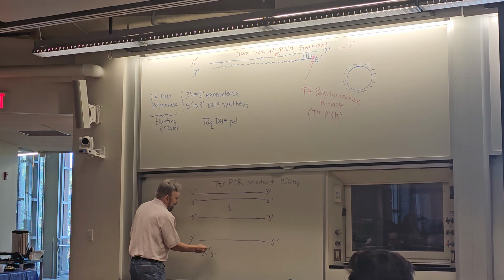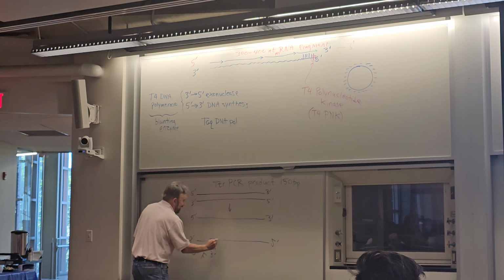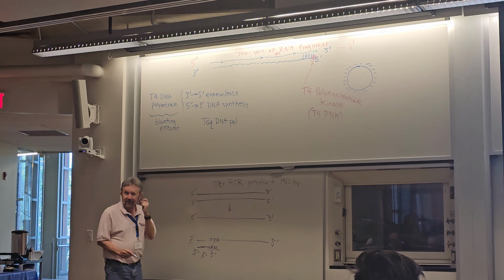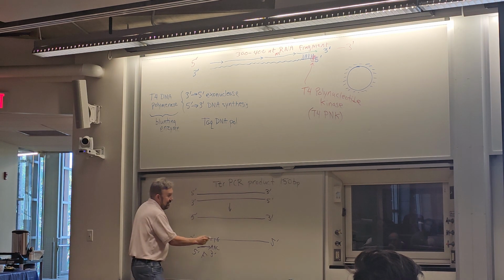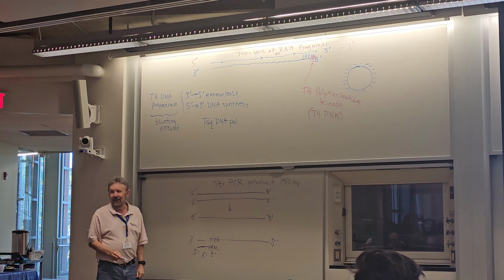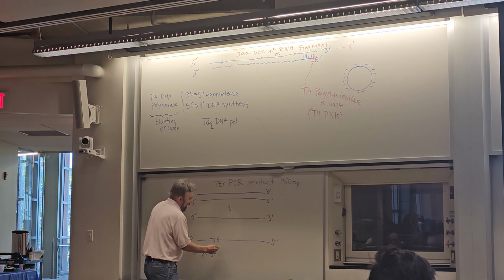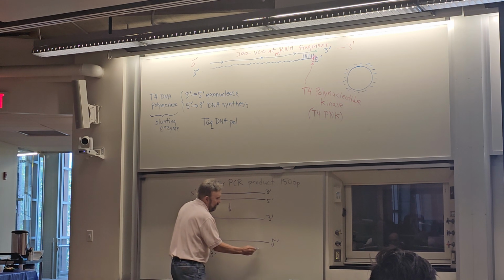And so we're going to start the sequencing reaction here, right? So if there was a T here, we'd get an A here. And if there was a T here, we'd get an A there. If there was a G there, we'd get a C here. So we're going to start reading after the end of the primer. That's why you lose this sequence here. You're not going to get the first 20 nucleotides. Likewise, the first 10, the instrument can't really read because those fragments are too short for the matrix to resolve well. So you're going to pick up the sequence down here somewhere, and it'll sequence along down your 150 base pair molecule.